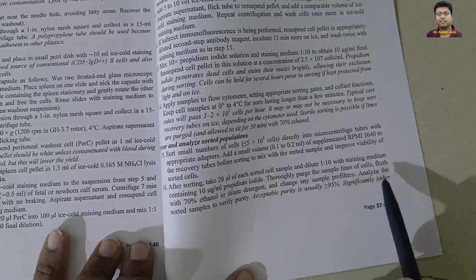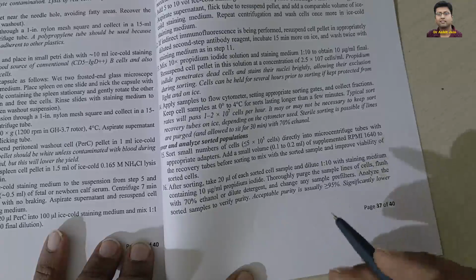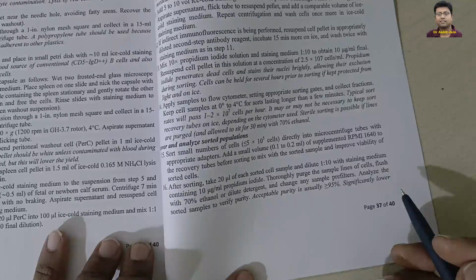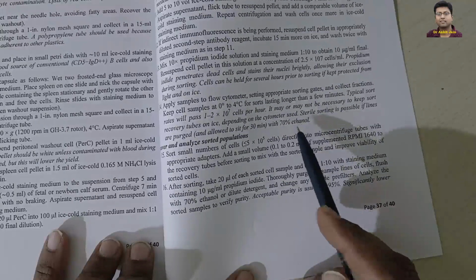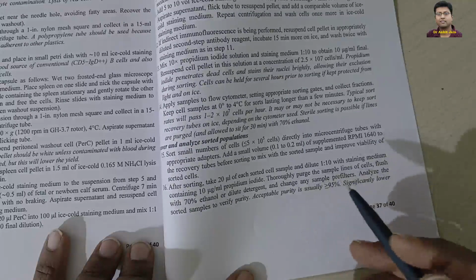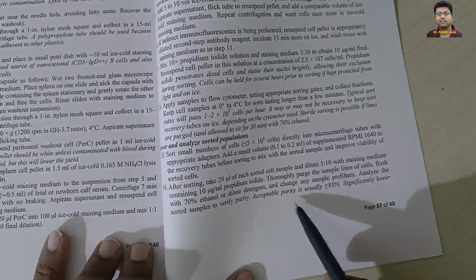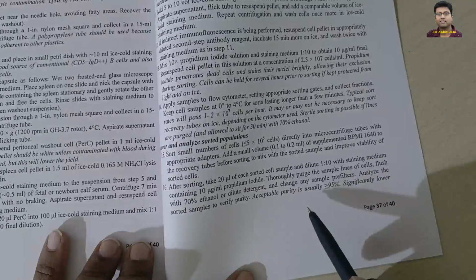अब जब हम staining medium में और with the propidium iodide हम चेक करते हैं तो बहुत सारे न्यूक्लियस जो होते हैं स्टेन हो चुके होते हैं. So we have to analyze that कितना जो है सेल लाइव बचा हुआ है. और इसी बीच हमें 70% हमने जो पहले इथेनॉल डाला था उसको भी रिमूव करना होगा ताकि जो भी इथेनॉल इसमें है वो उड़ जाए, चला जाए. और ये देखा गया है कि जो एक्सेप्टेबल प्योरिटी है वो more than 95% होनी चाहिए. So here we have to check actually the purity of the sample.